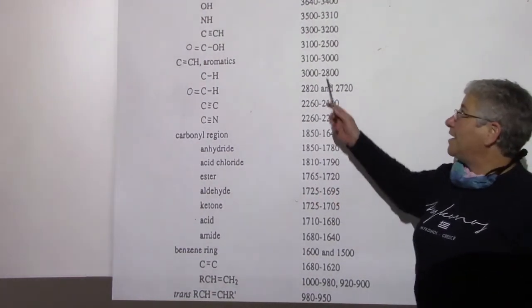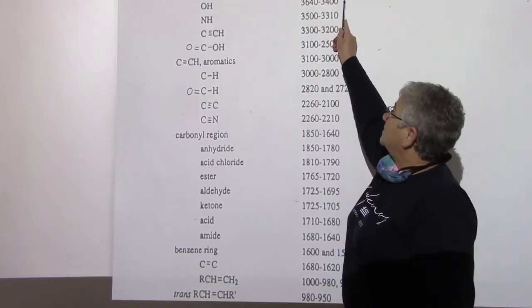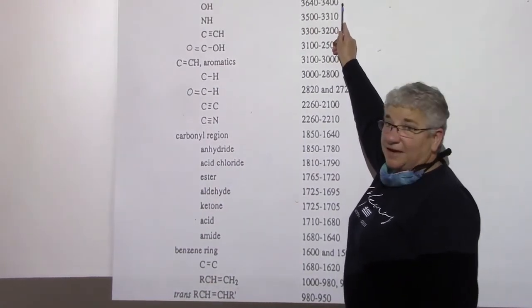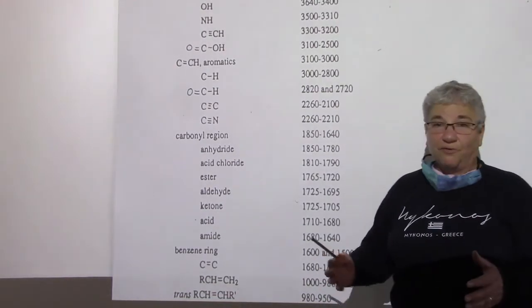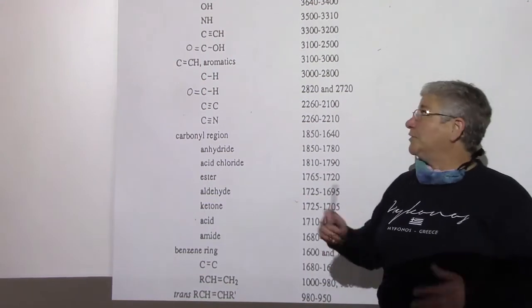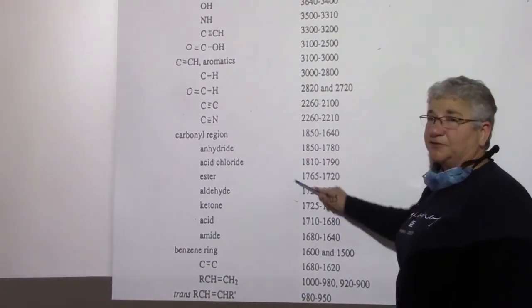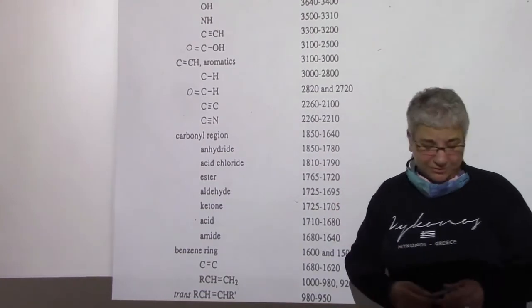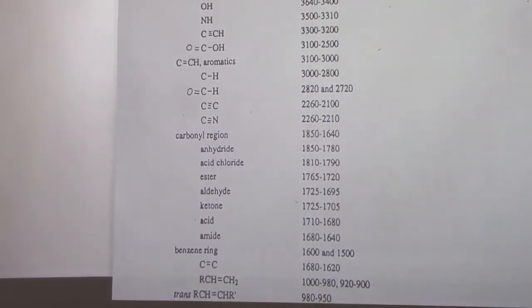Because again, an alcohol peak might be slightly here, might be slightly here, more likely slightly here, right? And you're going to say, oh, it's below 3,400, so it can't possibly be an alcohol, and that's absolutely not true. So just notice that these regions differ very much from these regions, right? So we'll do specific examples of them. And I've got to find a pencil that works.